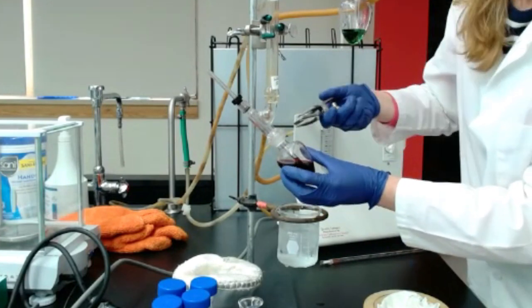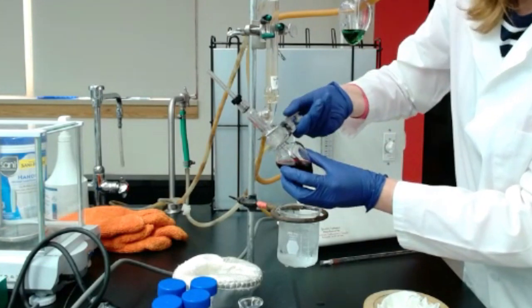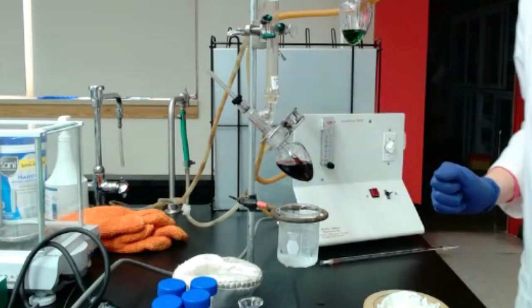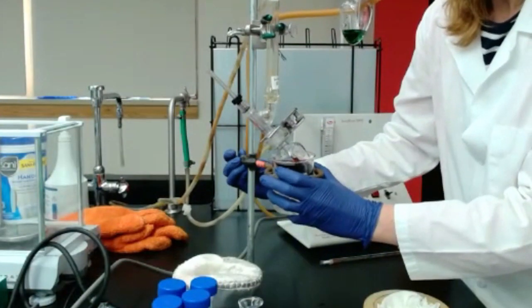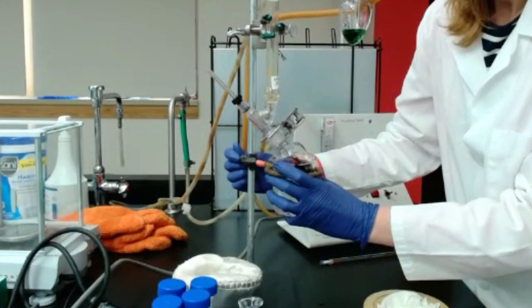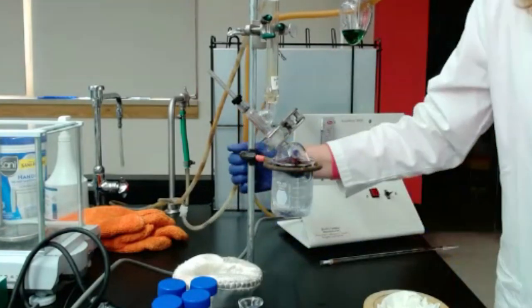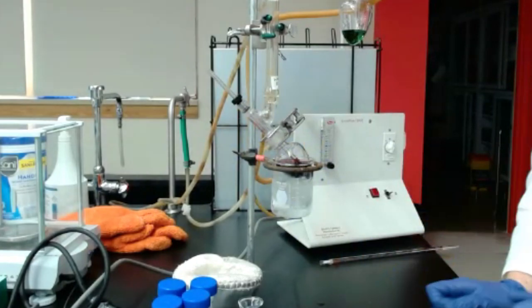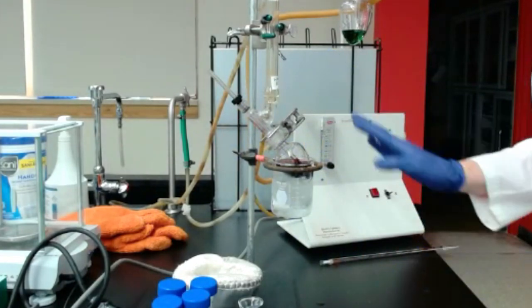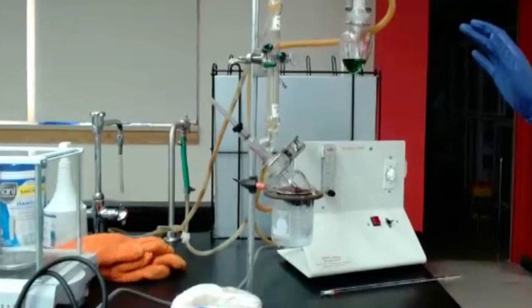So once you have it, just use the other clamp and fix it. And if you can keep it cold, that's the best. In our case, we're using a beaker with some ice. If you do have ice, make sure you keep it in ice. Once everything is set up, make sure all the connections are correctly made.